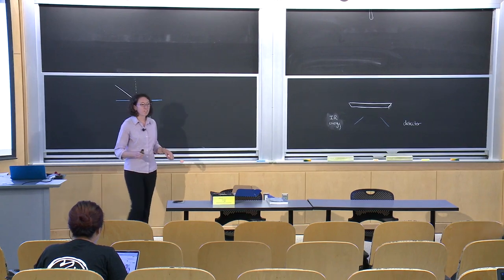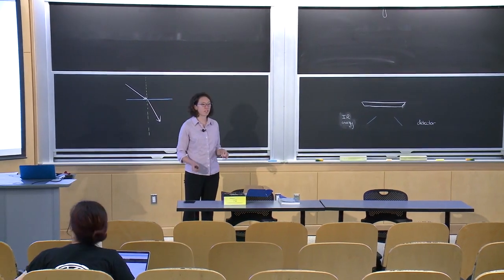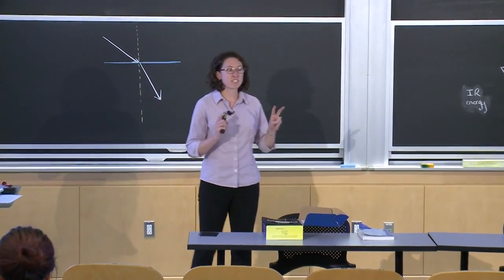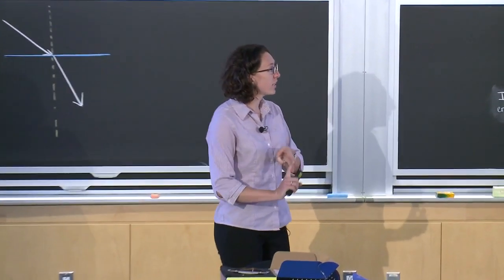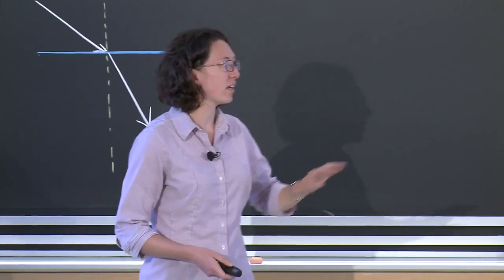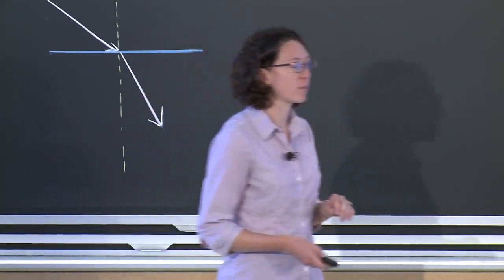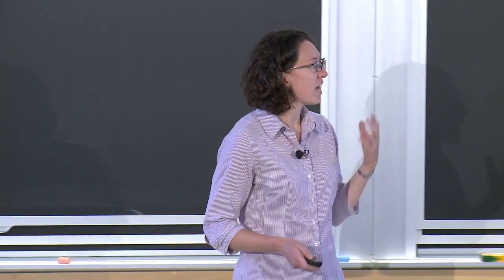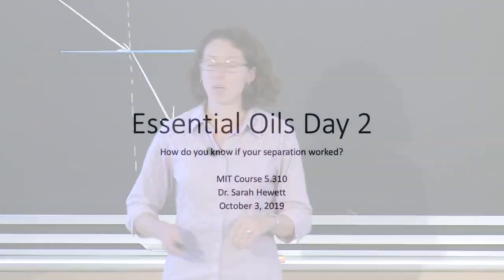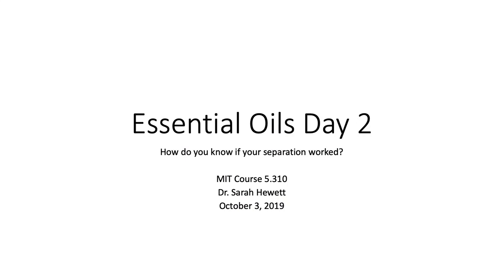All right, good afternoon. We should get started because we have a lot to talk about today. So today is the second in a series of 3 lectures about the Essential Oil Lab. You'll get a third lecture in a little bit about X-ray crystallography, but today we're going to finish talking about the main synthetic parts that you'll be doing in the Essential Oil Lab. So today we're going to talk about if your separation worked.